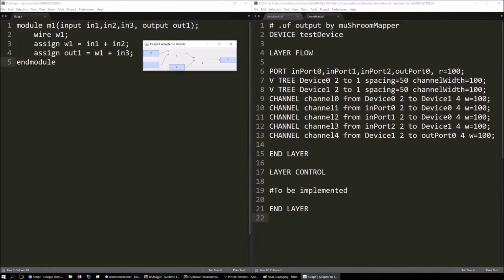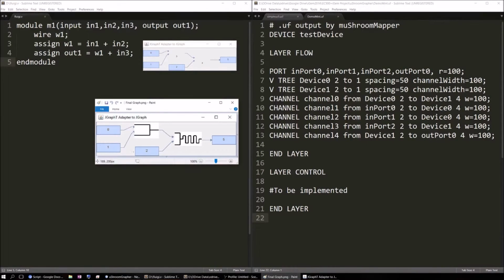However, unfortunately, the custom images where the microfluidic components should be are not currently working. However, if they were to be functional, this is what they'd look like in a similar design. The only difference in this design is instead of two Y mixers, we'd have one Y mixer and one serpentine mixer, which could be easily implemented via our UCF file.